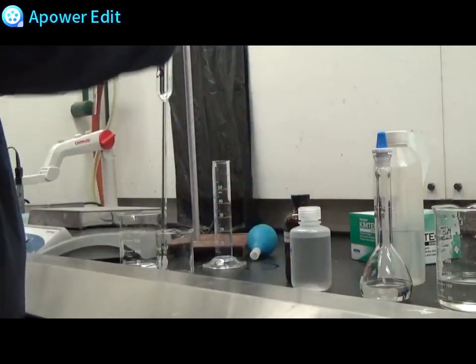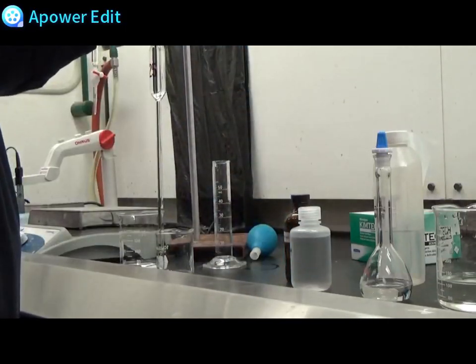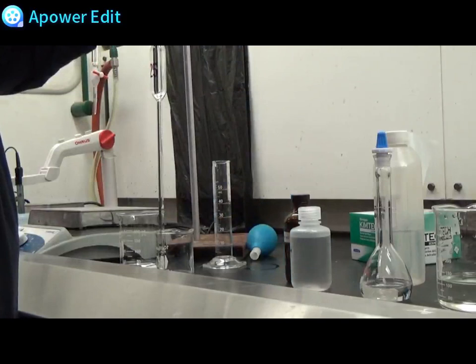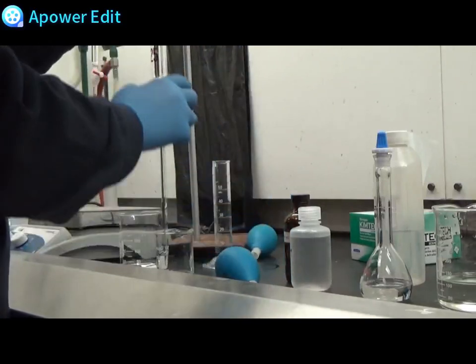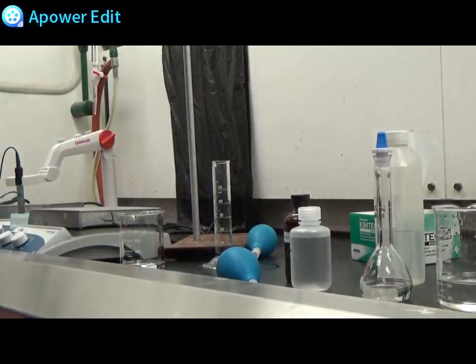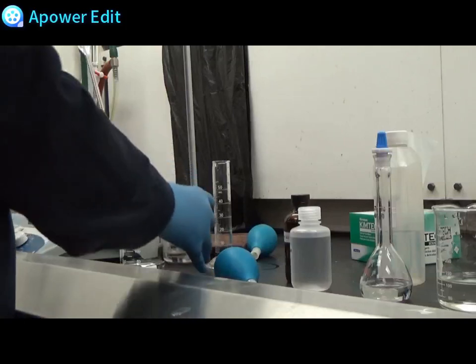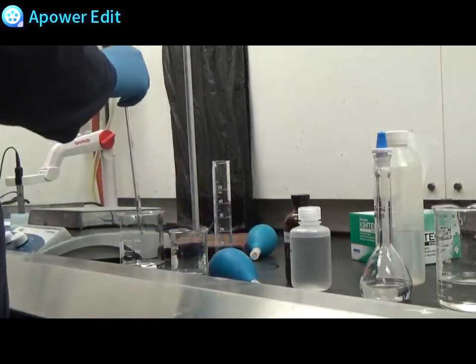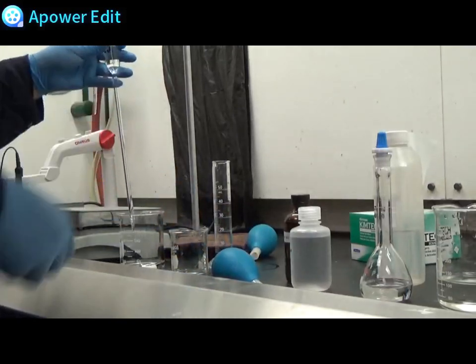You do need to see this at eye level so take the beaker and use it to help you see the line at eye level. Perfect. Now transfer it to your titration beaker.